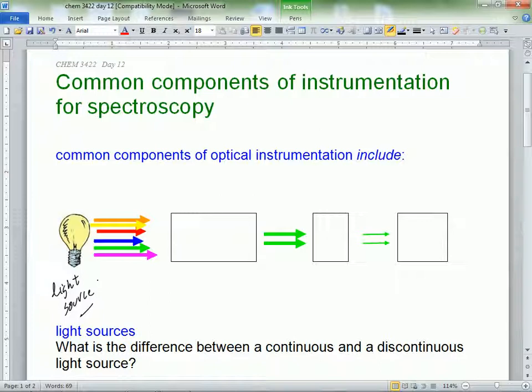So this first black box seems like its purpose is to what? Right, filter. Because look at all these colors you have, only one of them is coming out. You could use one of those glass filter doohickeys that only lets green light through. That would work.